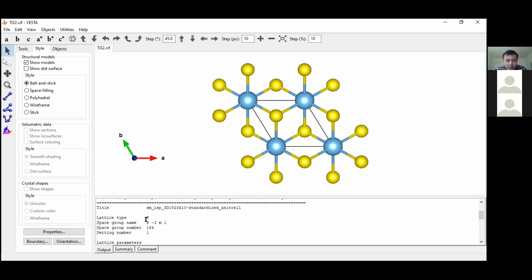So this is basically the space group information about this material. It is P 3 bar M, I'm sorry, P 3 bar M1. If you happen to have time to look at the International Tables for Crystallography and pick up some learning materials, you probably have some idea of what these notations mean, right? So this is a trigonal system. That's why it has the 3 bar symmetry in the first place.